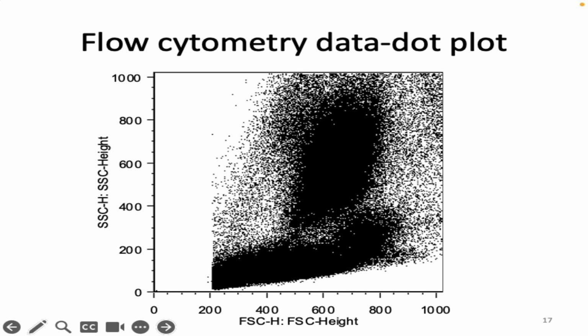You can also see that there are some places where the dots are denser than others, which we often think about as populations of cells. Yeah, there's a weird cell over here, but there are also places where there are big populations of cells. And sometimes it's actually a little hard to look at. You're like, okay, is this area denser than this area or not? I don't know. At some point, it's just black.